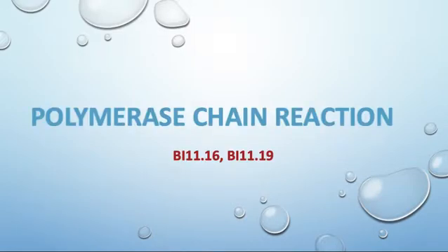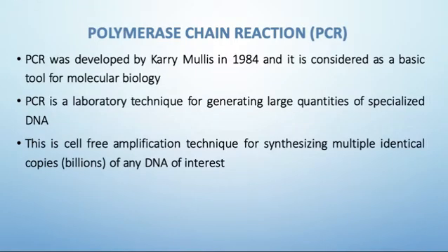PCR was first developed by Kary Mullis in 1984, and it is considered a basic tool for molecular biology. Here the laboratory technique generates large quantities of specialized DNA from a target DNA sequence. So this is a cell-free amplification technique for synthesis of multiple identical copies of the DNA which is of interest.